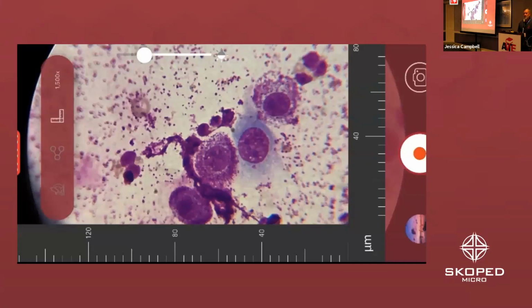Anybody? Ooh, I heard it. Yep, mast, like a mast on a boat. That's what I always tell people. M-A-S-T, mast cell tumor. This one was not too long ago, and I did a little social media blip about it. A lady saw a red bump on her dog that night and brought it in, and it was also a mast cell tumor. And we got it. It was little bitty instead of being really big.